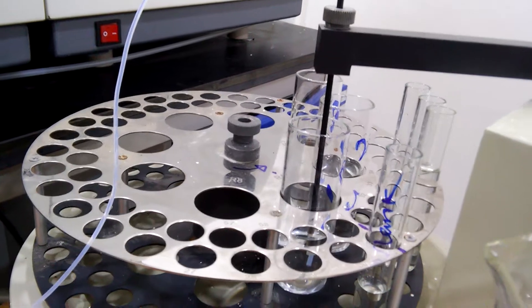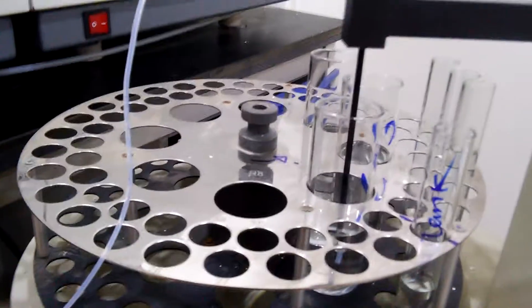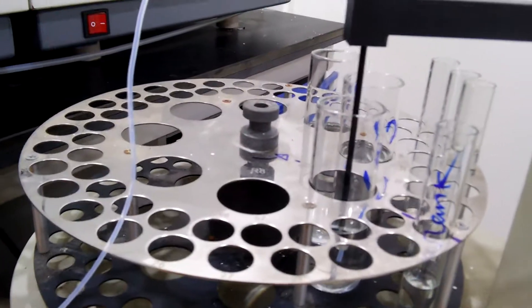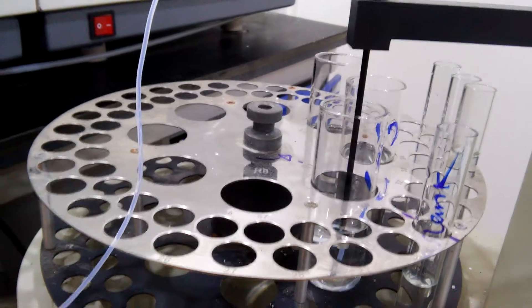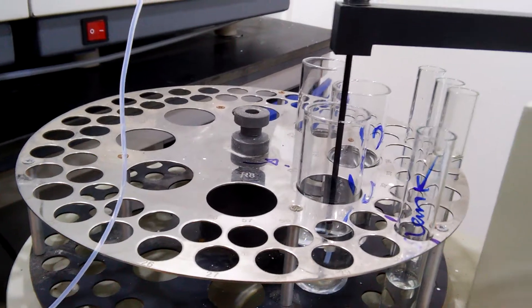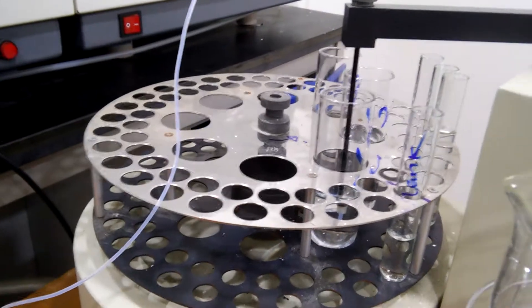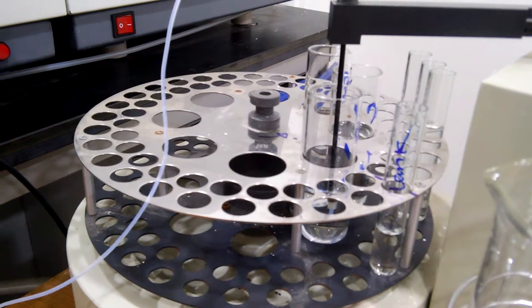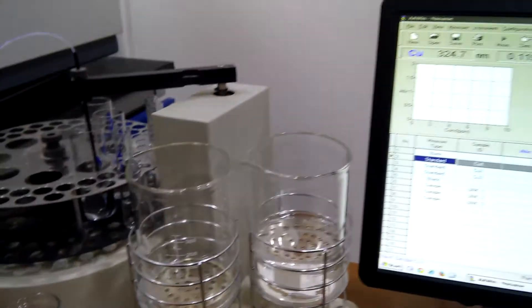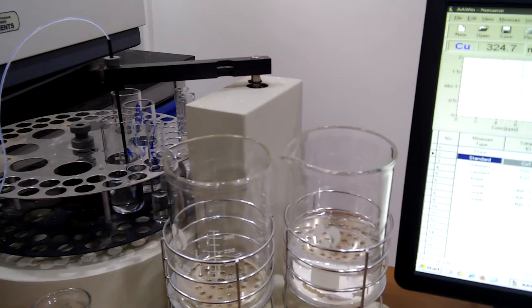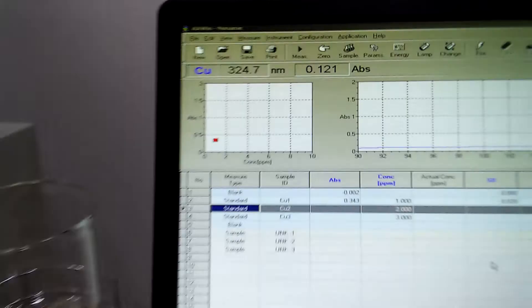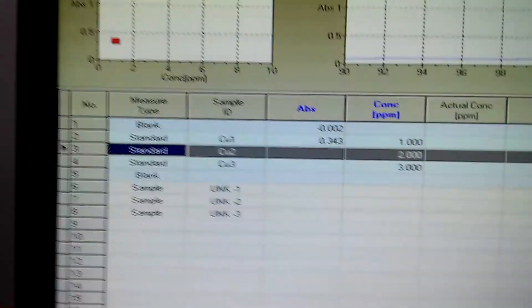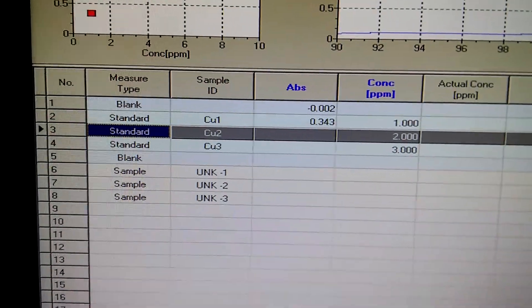This is 1 ppm. This is the standard, the first standard of copper. This is the result.